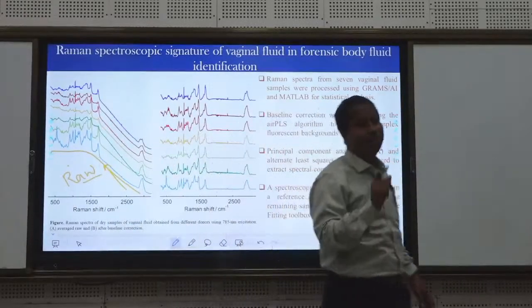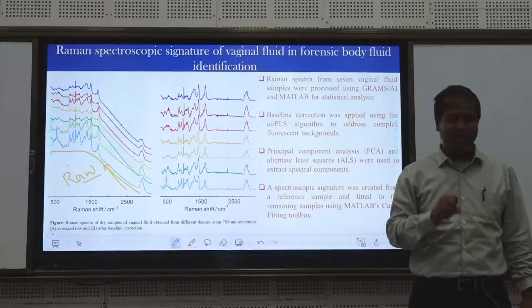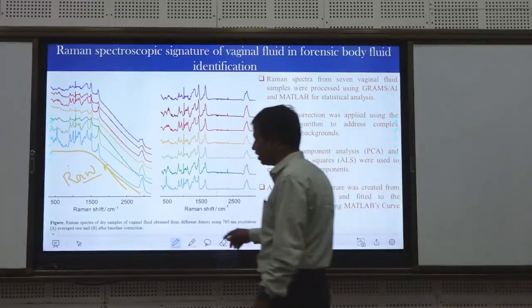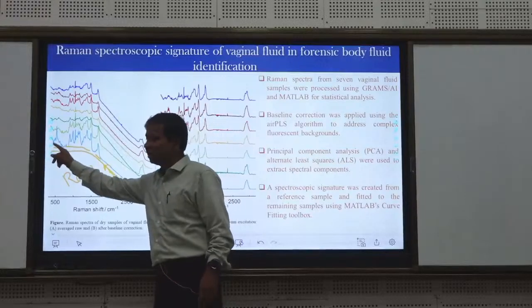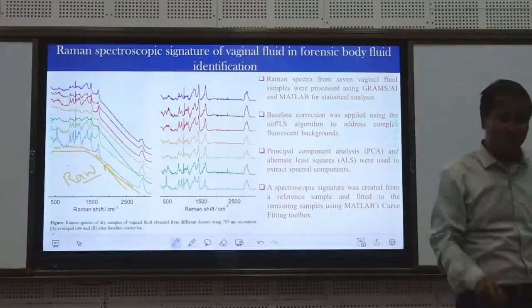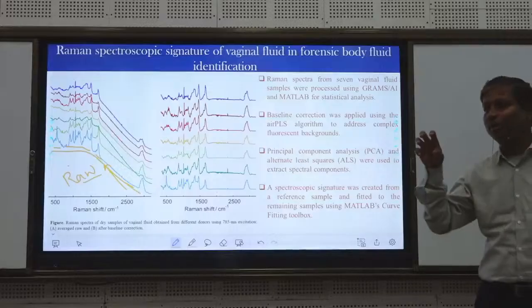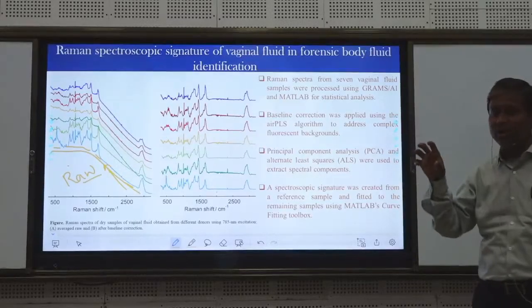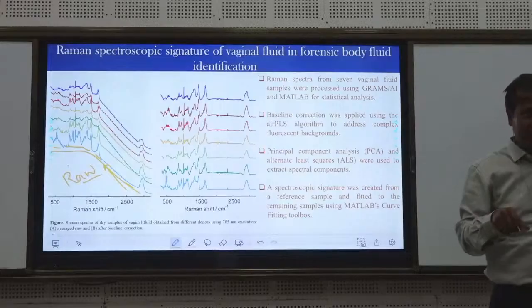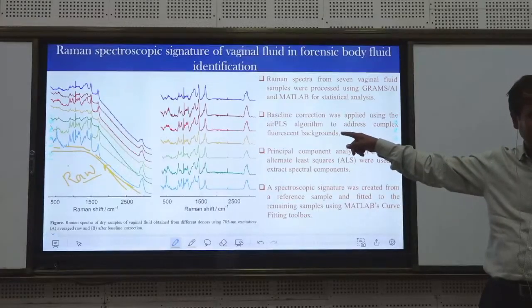That has some mathematical significance. Whatever polynomial you are using, and why you are using that polynomial, is not just that you select it and then deduct it. It should have meaning. That is why there are some groups who do only this, and based on their work, those kinds of formulations will be in your machine. In a machine program, that program allows you to do this kind of operation.